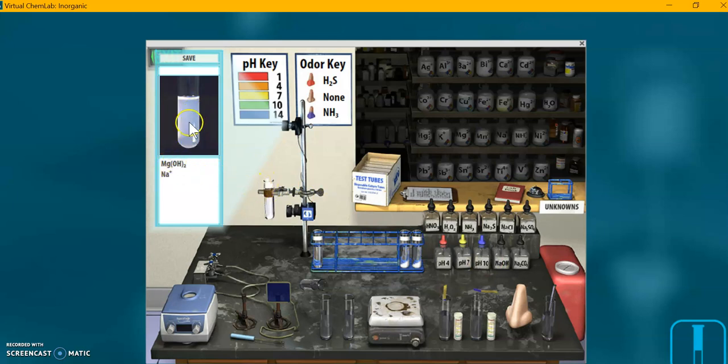And we seem to have cloudiness, another sign of a precipitate. We can see the chemical list, magnesium hydroxide, a precipitate. So we've shown that we have magnesium in there.